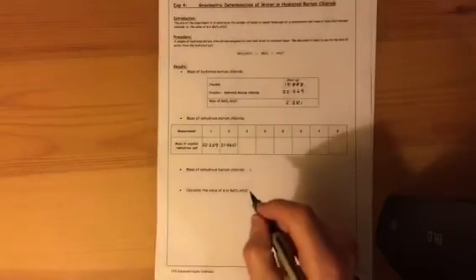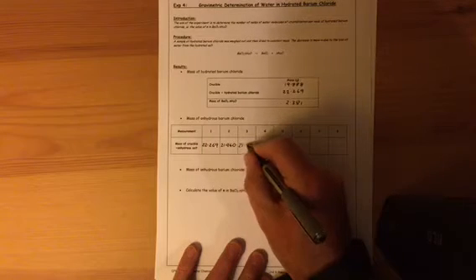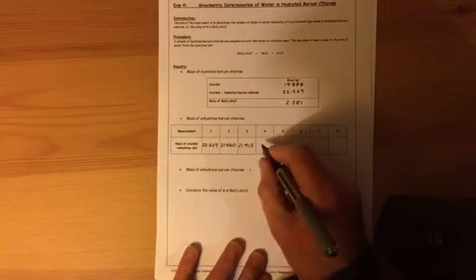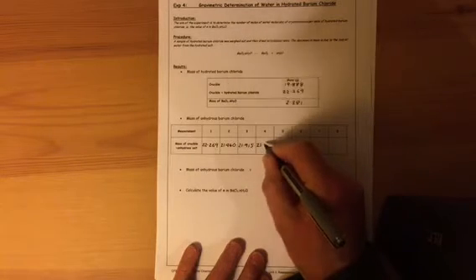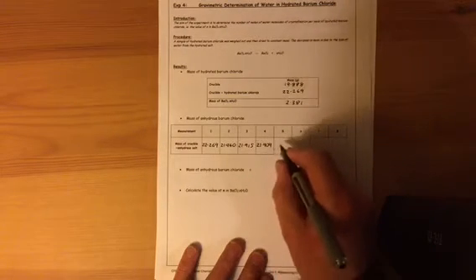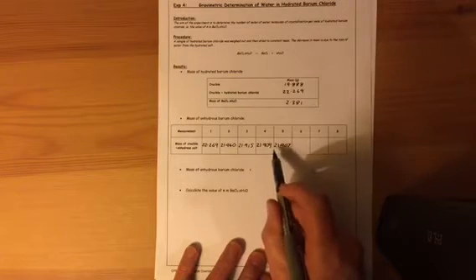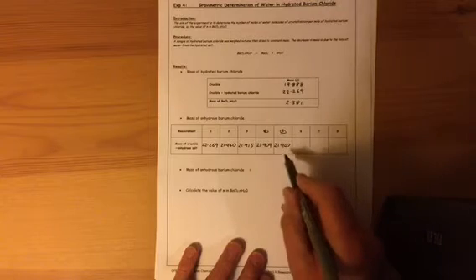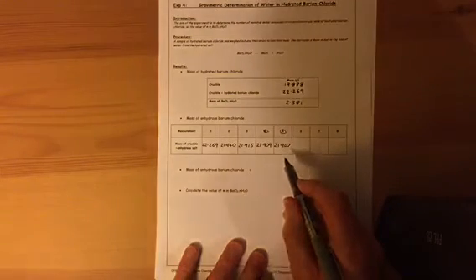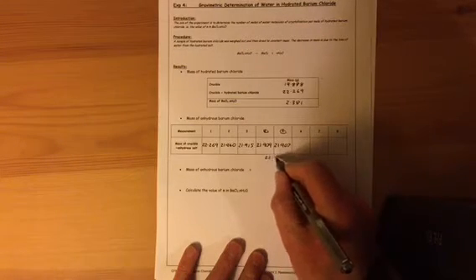Our third measurement of the crucible and the salt gave us a mass of 21.915. So the mass had continued to drop as we were still losing some water. Our fourth measurement gave us 21.909. So not dropping nearly as much, but still greater than 0.002. Our fifth measurement gave us a value of 21.907. And because results 4 and 5 are both within 0.002 of each other, that is defined as no further mass loss. And that's the sample dried to constant mass. So for our dried weight, we take the average of these two values, which is 21.908.